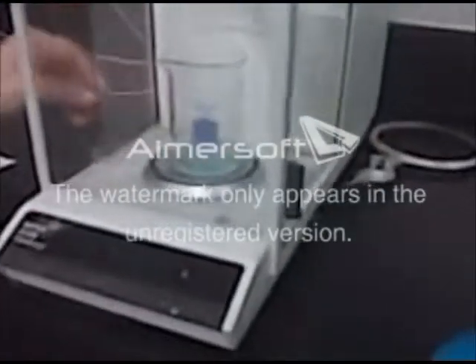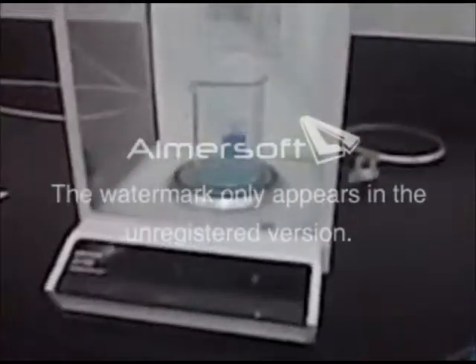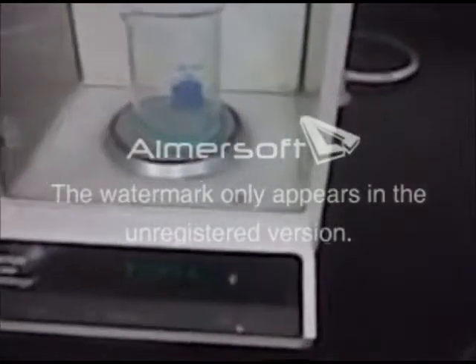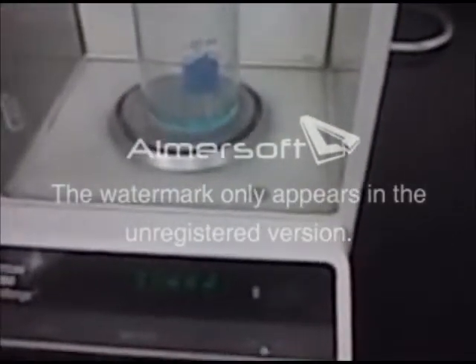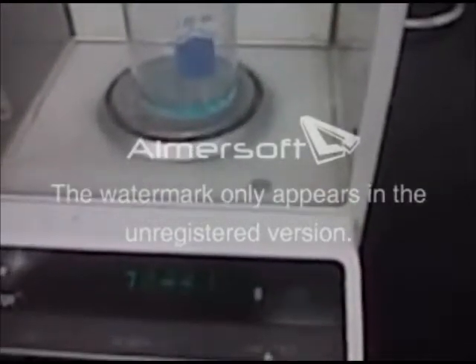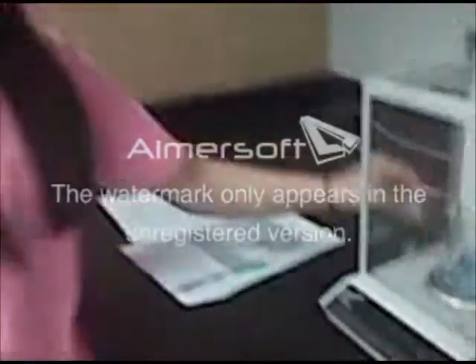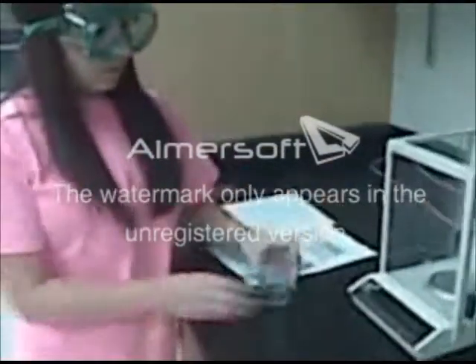You're going to place the beaker on the scale. This will set the balance to 0 grams. And then record the weight, which is 70.651 on the balance. Now, record the weight. This will be your initial weight.